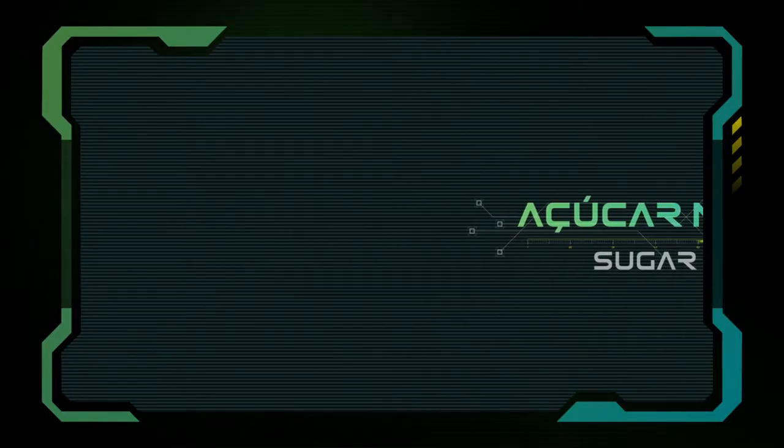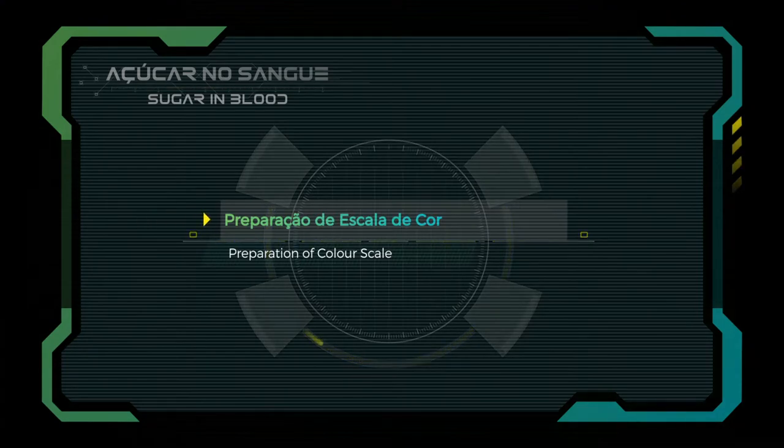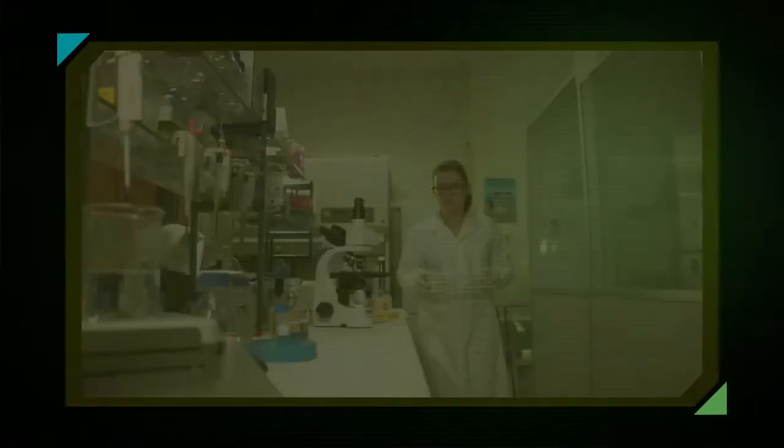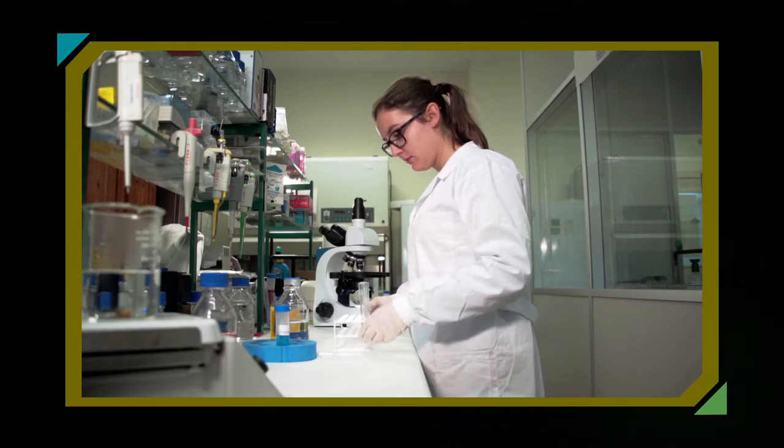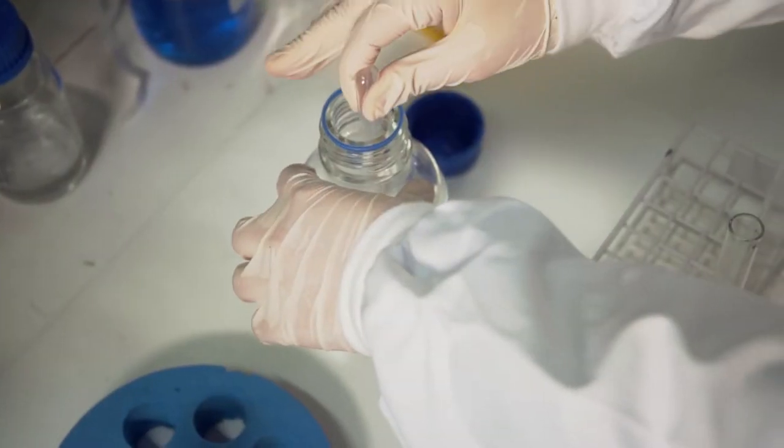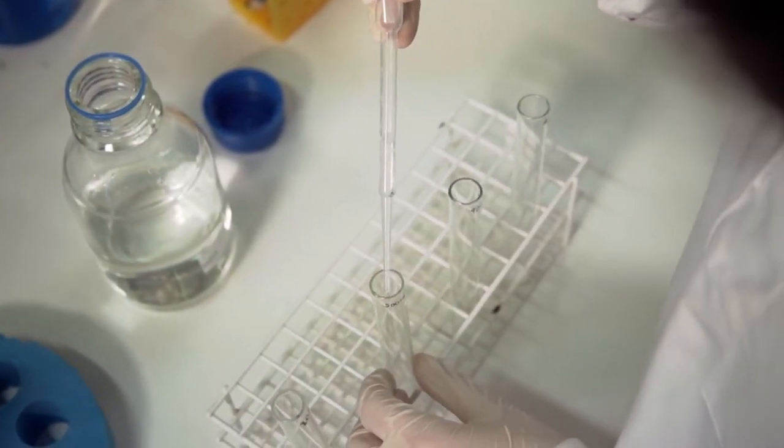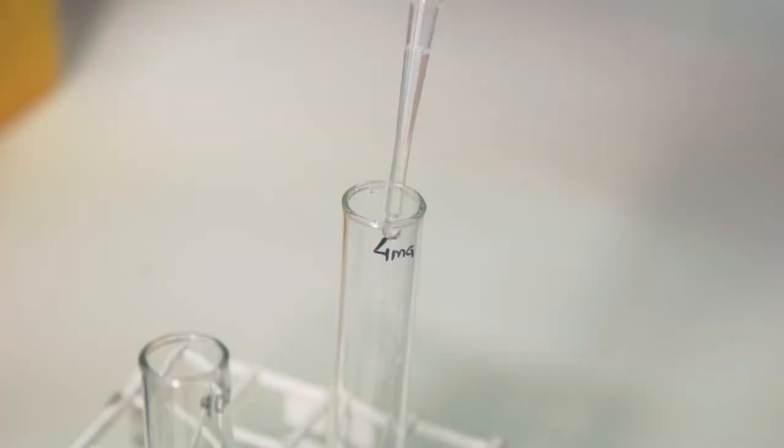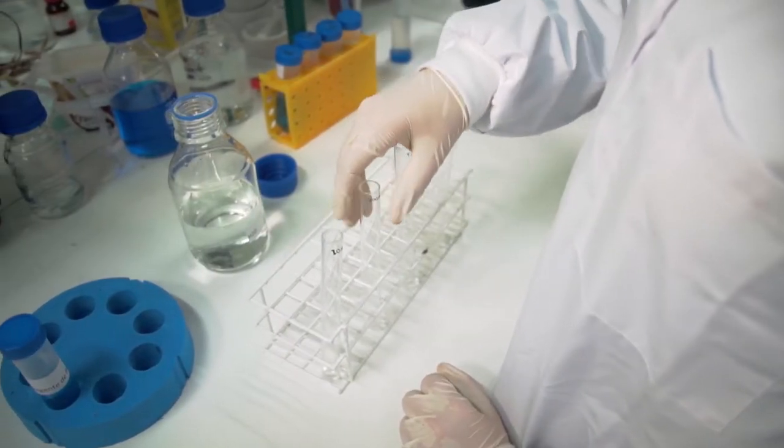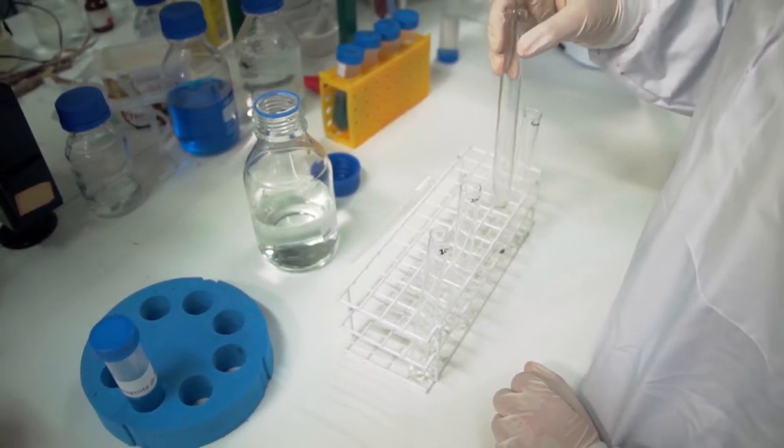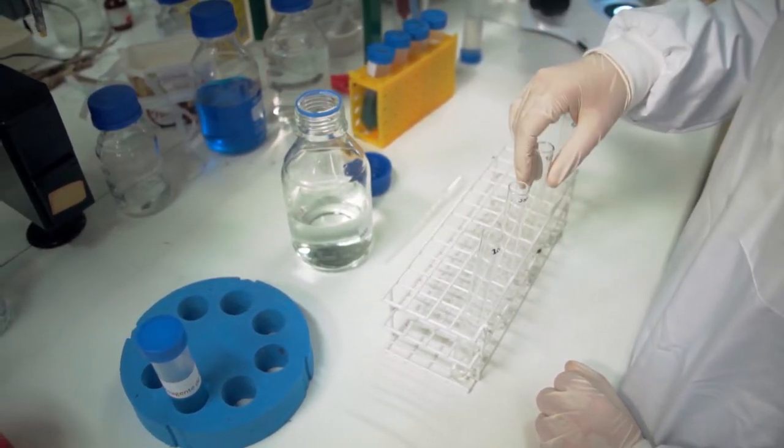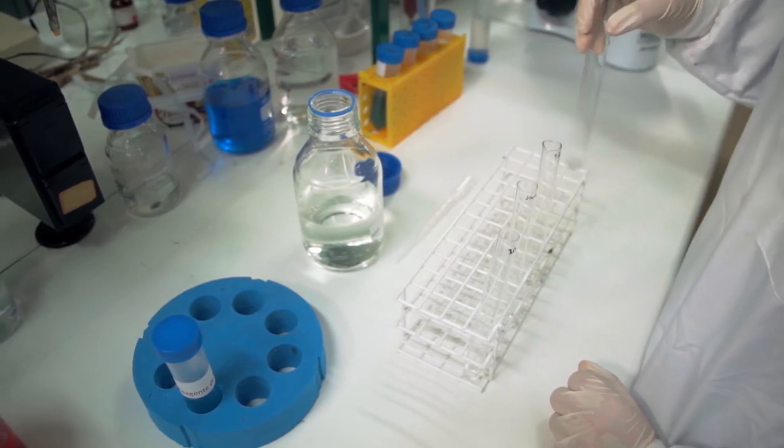E passamos agora para a preparação da escala de cor com as diferentes concentrações de frutose. Em vários tubos de ensaio com concentrações crescentes de frutose, vamos adicionar, com a ajuda de uma pipeta de pasteur, 30 gotas de água em cada um. Em cada um dos tubos adicionamos diferentes quantidades de frutose: 10 miligramas, 500 miligramas, 900 miligramas, 4 gramas. Agitamos os tubos de modo a que a frutose se dissolva na água.